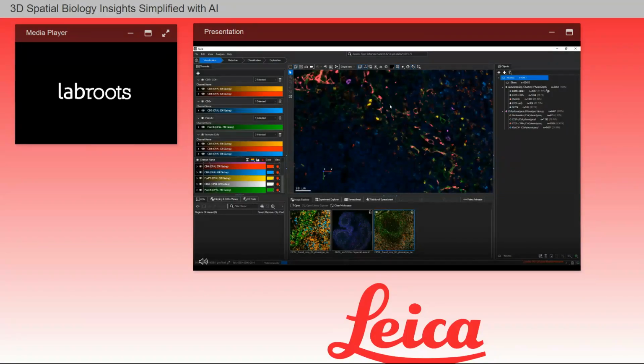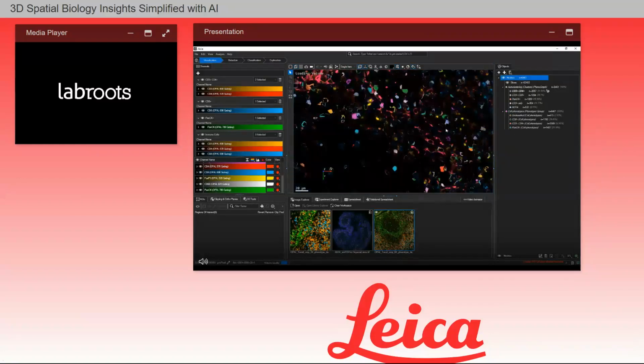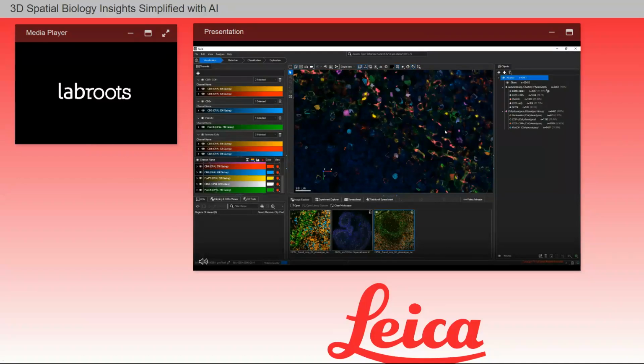I am going to my object settings to turn on the meshes object set. The camera sync view will also work with object sets, so this gives me a way to examine my objects in my multiplex image in 2D and 3D.